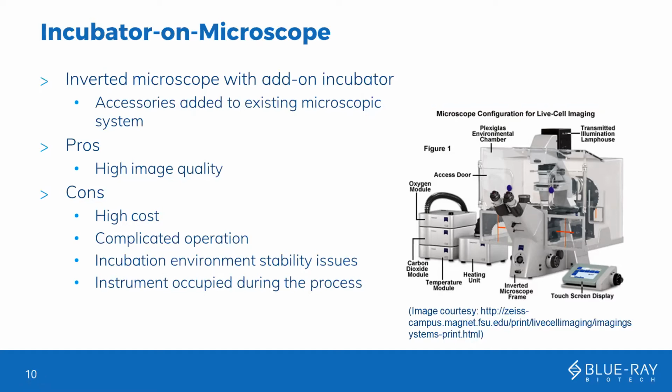The advantage of this system is high image quality because it's a regular microscope. But the downside is that the price is very high, the structure is very complicated, and the culture environment is very easy to change. So this is our first concept, the incubator on microscope.